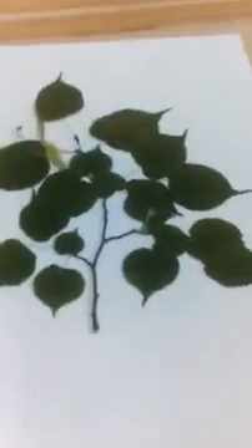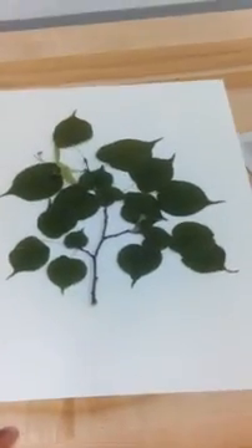But something like this — nice, clean, crisp — and shows what the plant looks like, is a good thing to press.